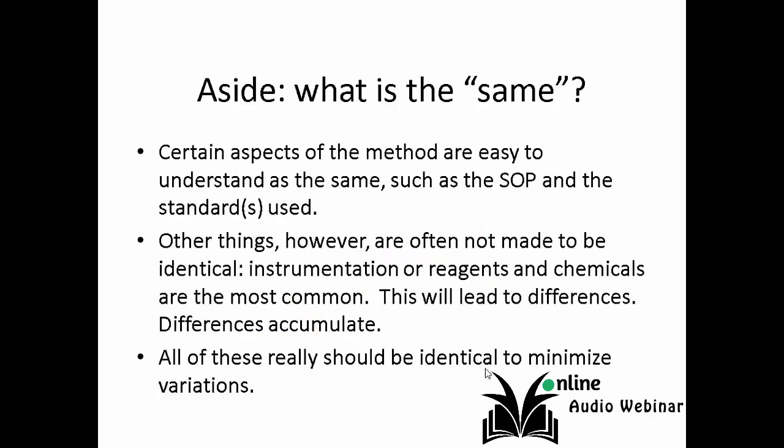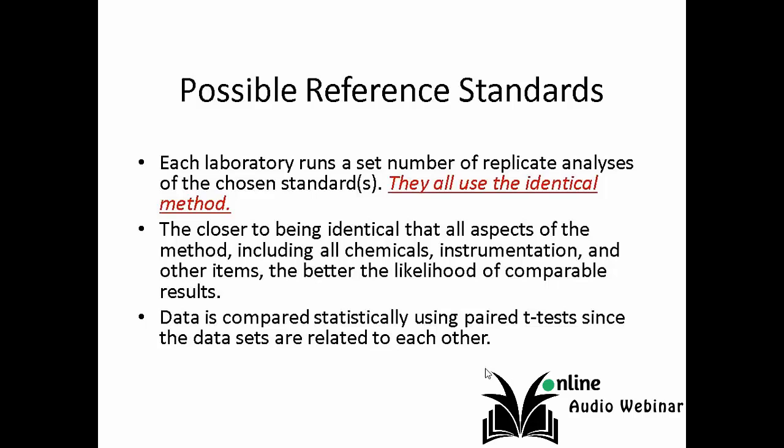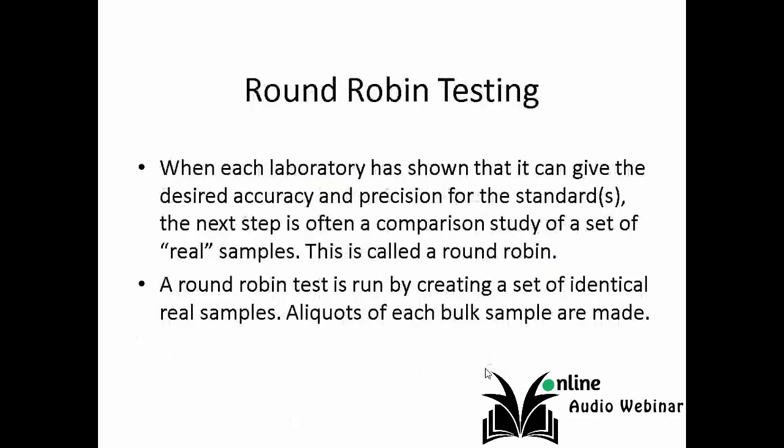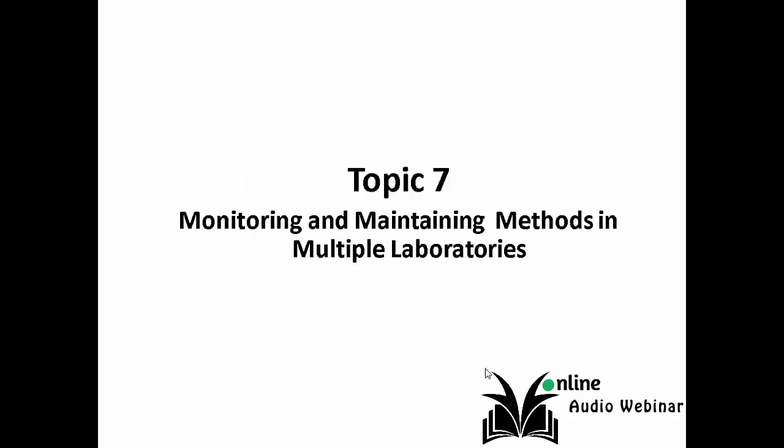Once again, "same" is always a question, and you have to spell that out. It's an error that was emphasized in interlaboratory data. These things are just explanation for some of the things, was that round robin testing and doing that as an ongoing approach was very important. These are just some repeats of some of those things.